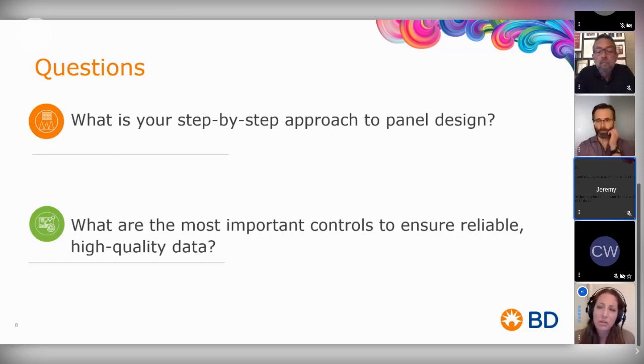So there, just think about what might be particular in your system. If you're using specific buffers that might affect markers or fluorochromes, and whether you can circumvent that or whether you might just have to work with other markers instead. So that's just my approach in a nutshell. Of course, there's always more to it than that, but I'll let Rui pick up from here and see what else he has to add.